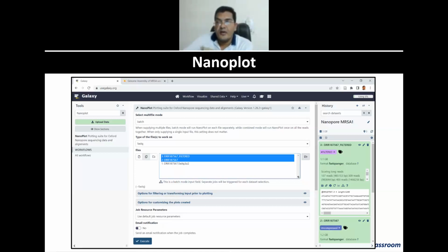So this is where somebody got stuck in the initial part of the talk. Somebody was saying that I didn't get enough files. No, sir, I got the plots actually. After the assembly step, I got stuck actually. I got all the plots. Okay, so then it is fine.